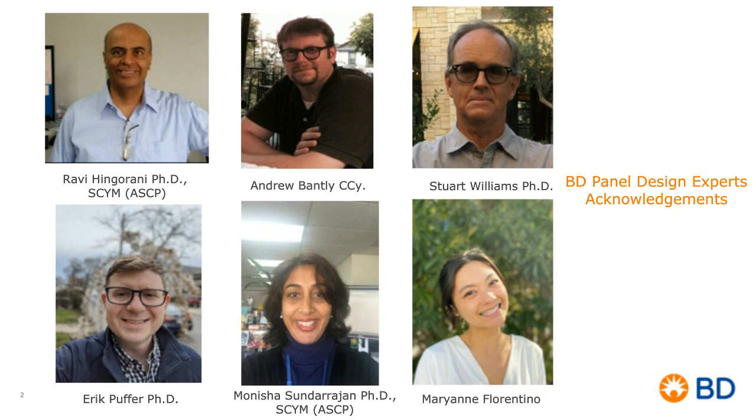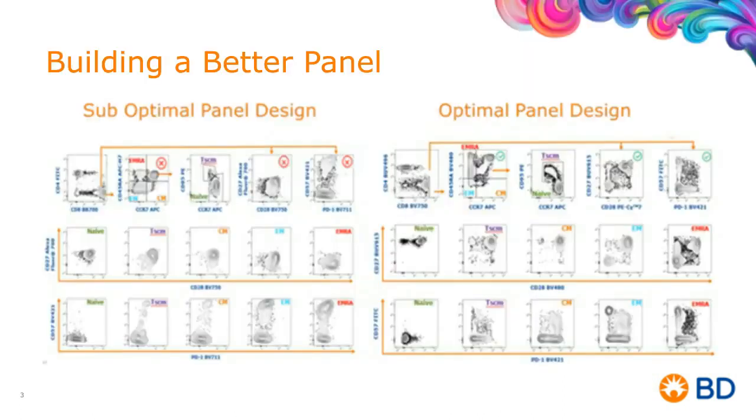As we begin today, we'll always look at the panel that we just made, which in many ways, or oftentimes, is suboptimal. Meaning, I think if we looked at our panel, we might be able to say, I wish it could have been a little better on a given specificity, and to pull a different type of population out.